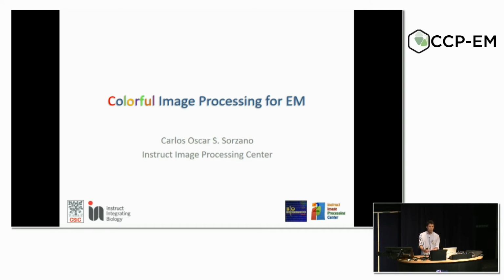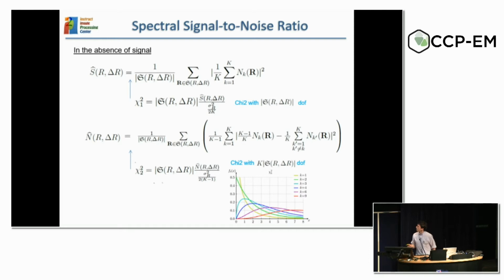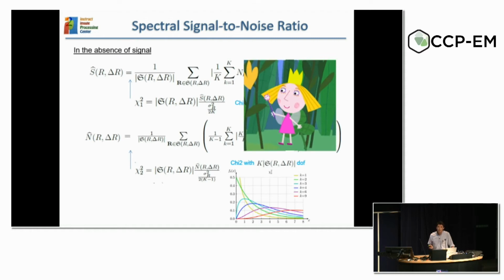Once you have acquired, what are the different options that you have? You could do a very simple processing and you will get a structure, or you can do a more complex processing and you will have a better structure. Actually, I'm the person behind all the mathematics and algorithms, but I'm happy to make them disappear and only present nice ideas.